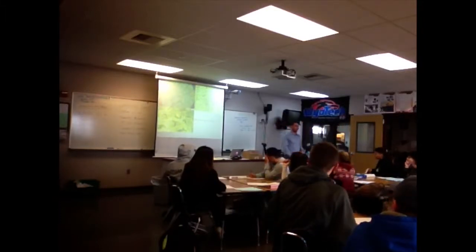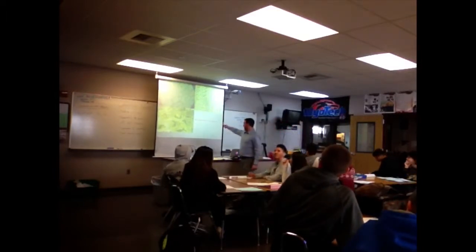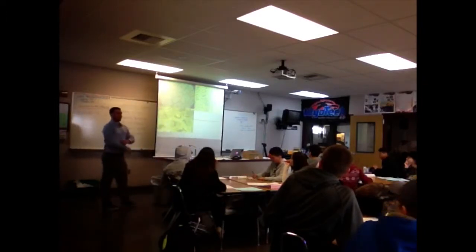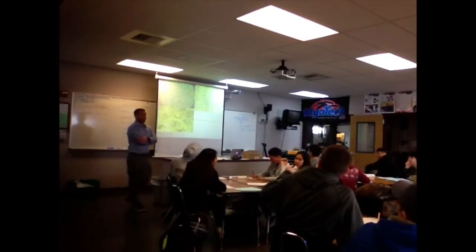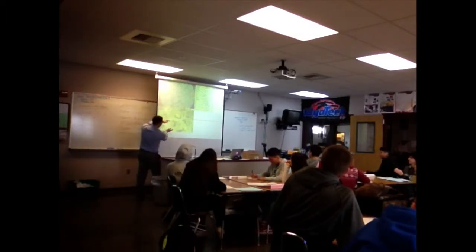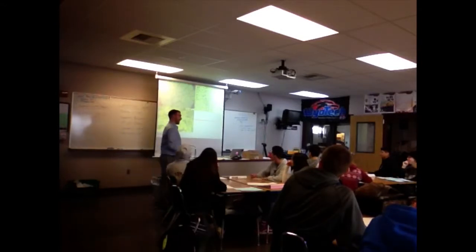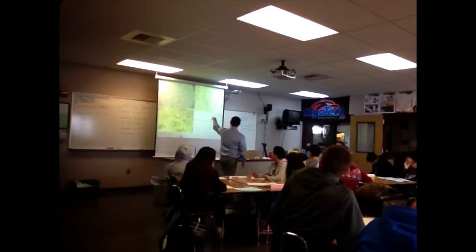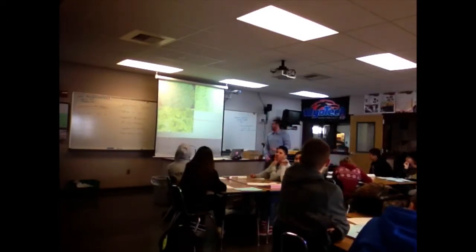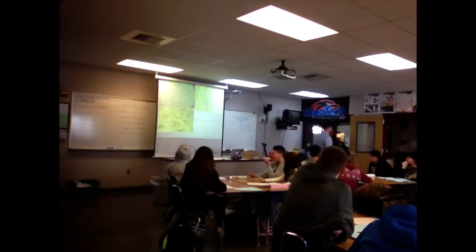So, what the heck are we looking at here? Cells, right? We're looking at cells. Like the question right there in the red, what characteristics are you noticing here? The green. Cell fibers. So they're green. What else? What kind of structures are we looking at? They look like little squares, right? What else is in those squares? Little black circles. Cells. Dots. The nucleus. All good.